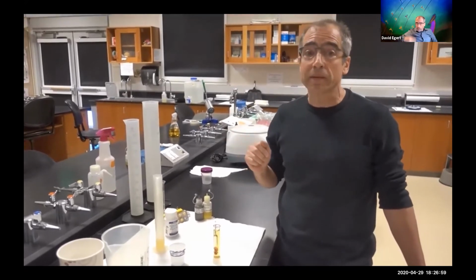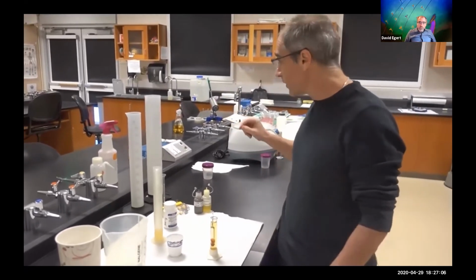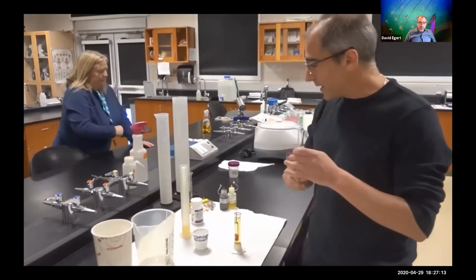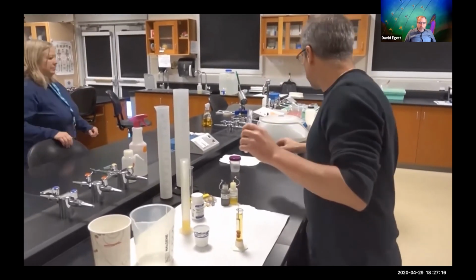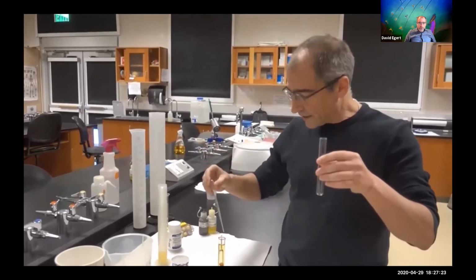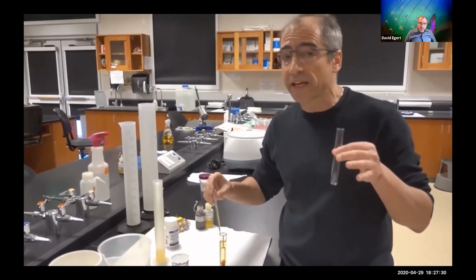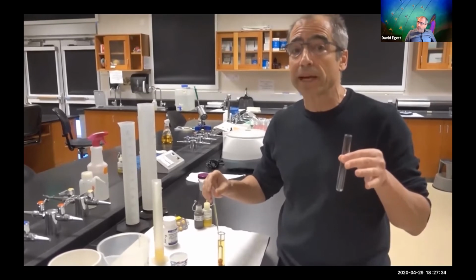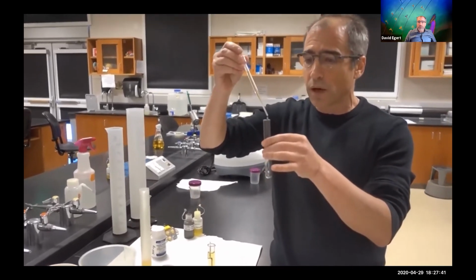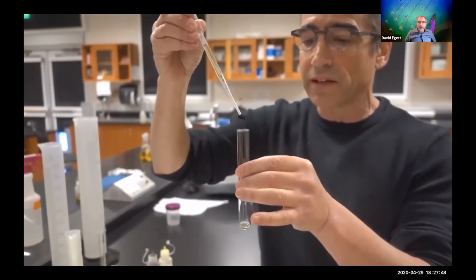Then the last part of this is I'm going to get the sodium chloride content of my urine. For that, I am going to need a little test tube and a dropper right here. Basically, I'm going to need 10 drops of my urine. And it matters that the drops are actual, well-calibrated drops. This is a quantitative test, and it depends on the numbers of drops that you're adding of different reagents. So it matters that I'm careful to add exactly 1, 2, 3, 4, 5, 6, 7, 8, 9, 10 drops of my urine.